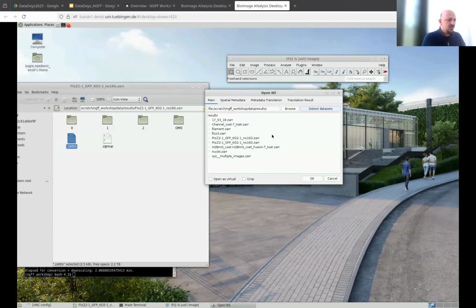This is one thing you can do also here. Let's say we come back to this one and we really want to see something from the top resolution image. What we can do is specify a range. In order to do this, you simply click this crop and then click OK.